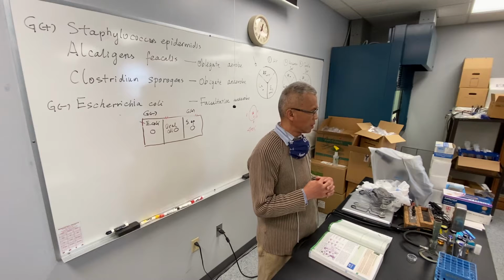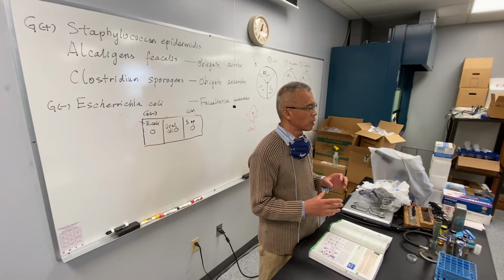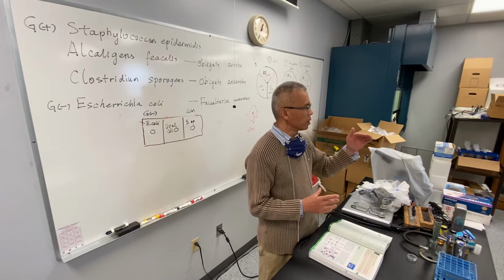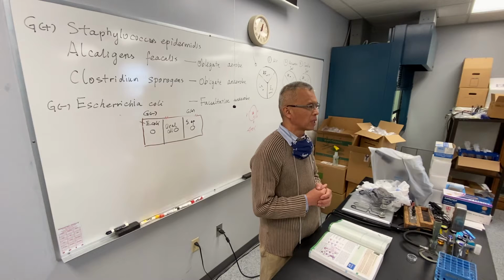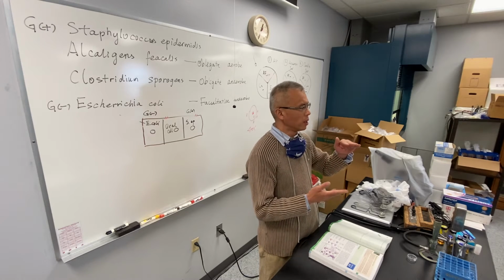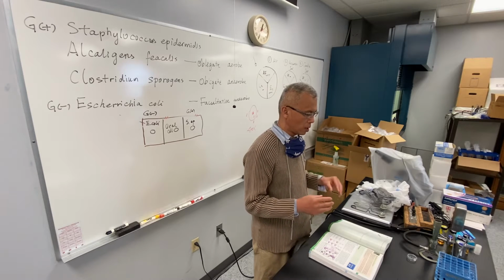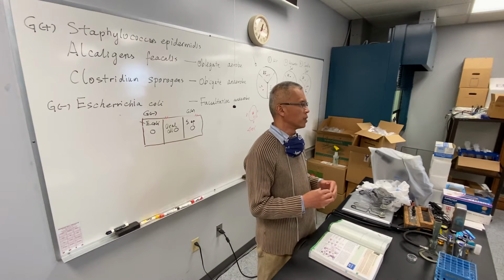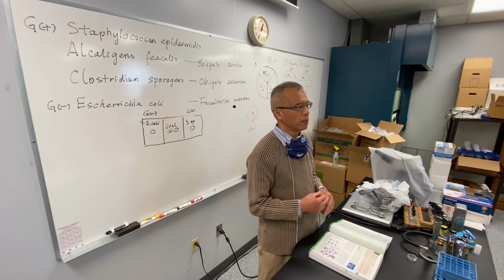They all look similar, but by structure, Gram-positive cells have multiple layers. Remember, we talked about 29 to 30 different layers, and Gram-negative cells only have one layer, sandwiched between the outer membrane and the inner membrane. So that's why the single layer of cell wall cannot retain the dye. Eventually, it can be easily decolorized by alcohol, right?